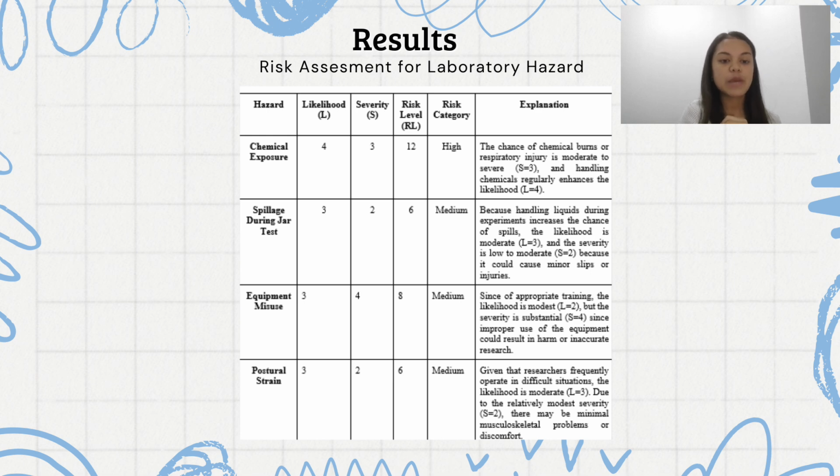Handling chemicals regularly enhances the likelihood, which is 4.